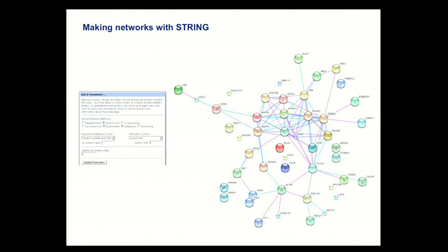In contrast, if you have a protein interaction network and you want to confirm the specific interactions that you're seeing, I would know which experiment to carry out because I would do a protein-protein interaction follow-up analysis. So I think those are the things that you need to balance a little bit. But if you just want to annotate your data, I think this is another excellent resource for that.